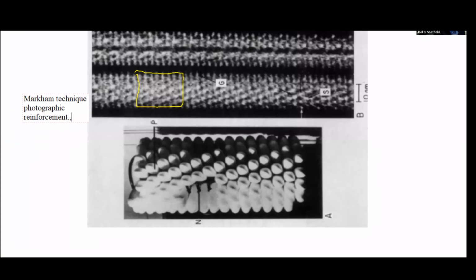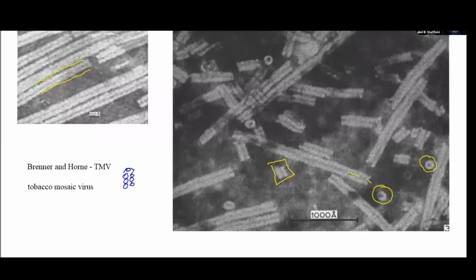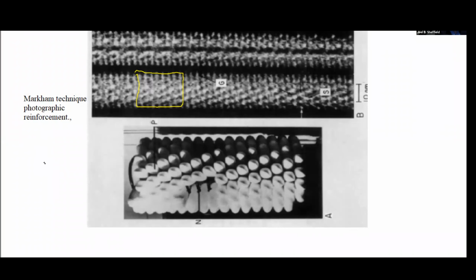One sort of cute alternative to doing this sort of thing is if you had a sample that you were looking at, like one of these circular ones, as long as it was a pretty clean circle, and you suspected that it had a periodicity to it, you could mount it on a turntable again. Here's a turntable. Put your sample dead center, or put a photograph dead center on that turntable. And now start spinning it.